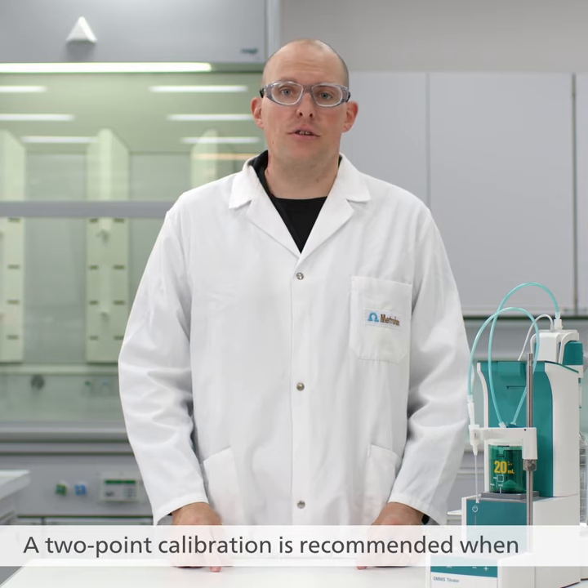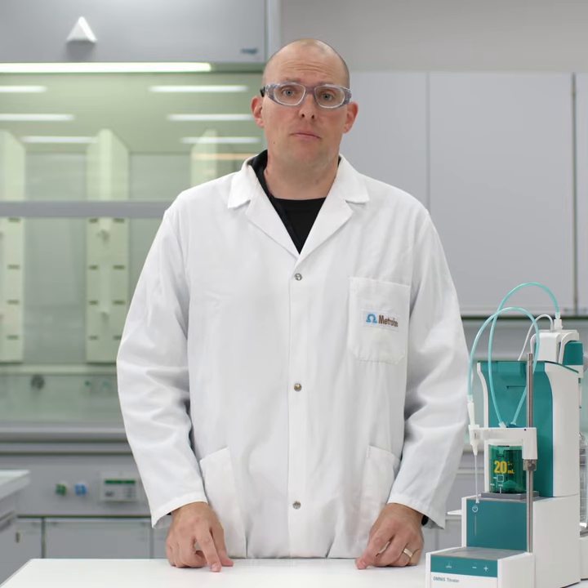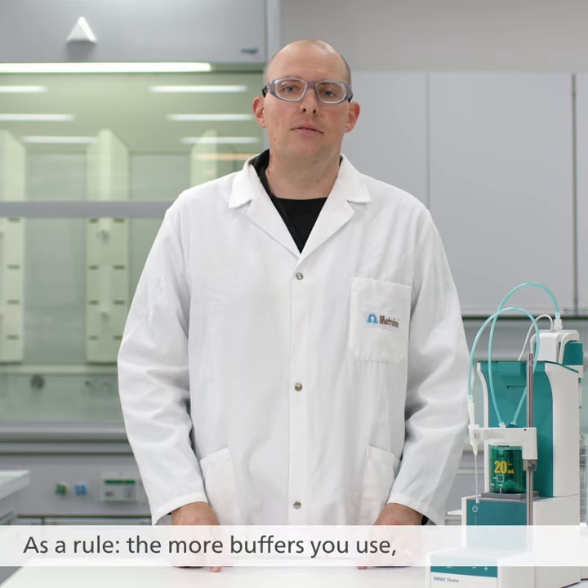A two-point calibration is recommended when the pH value range of your sample is narrow. If the pH values are across a wide range, then a calibration with three or more buffers is recommended. As a rule, the more buffers you use, the more accurate the calibration.